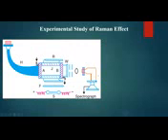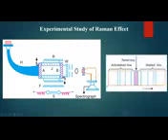It is observed that the scattered light contains a strong incident line and some lines having lower wavelength and some lines having higher wavelength. The lines having higher wavelength compared to the incident light are called Stokes lines. The lower wavelength lines are called anti-Stokes lines.